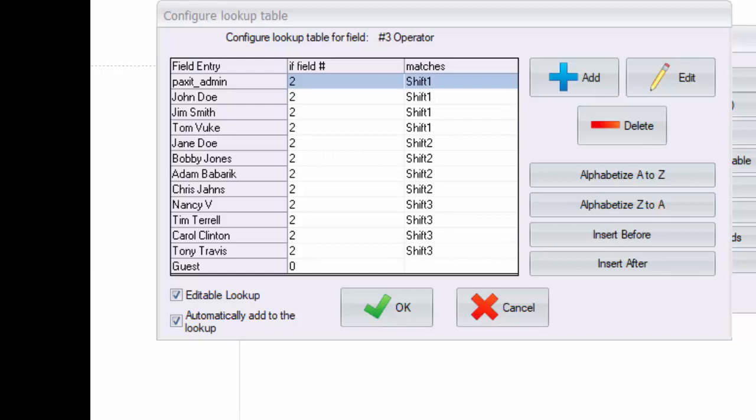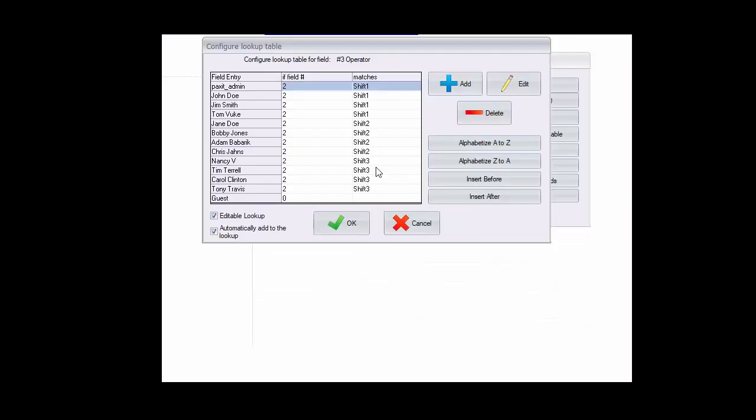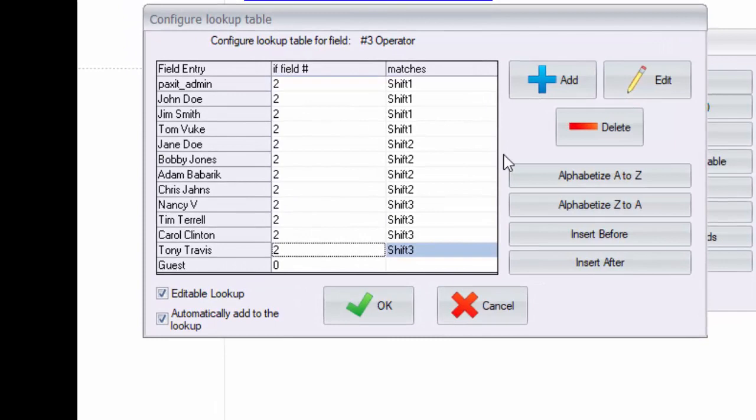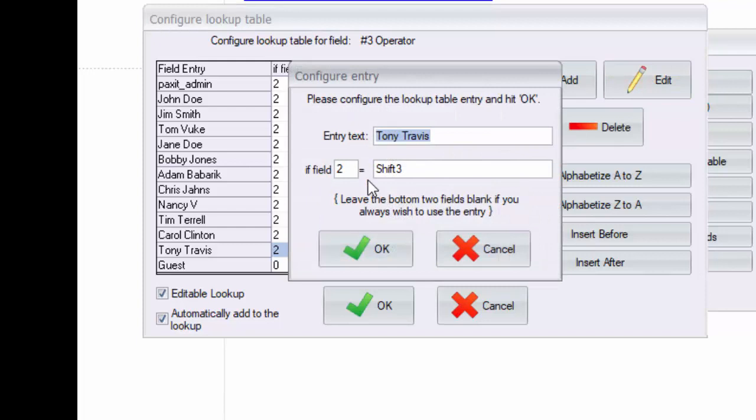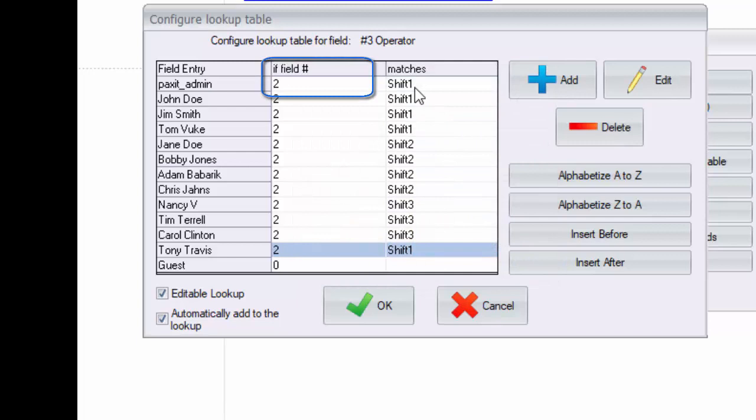Another feature adding flexibility to the Paxit database structure is the ability to link fields. We'll take advantage of that here because we want to link the list of operators to the shift that they work. That way instead of always displaying a lengthy list of all operators, the choices displayed are narrowed to only those operators that are associated with the shift that is chosen. To do this, enter the field number to link the entry to and the matching condition in that field that determines if the entry is used in the current drop down list.